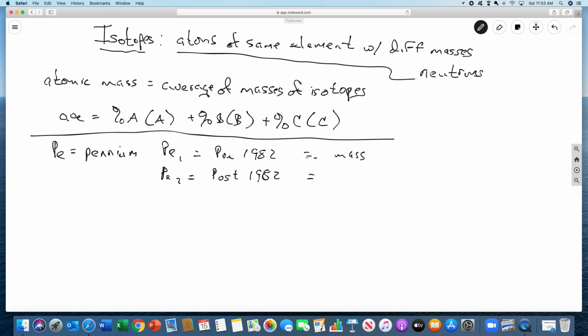And what you're going to do is you're going to take 10 of the pre's and get the mass and then divide by 10 to get the average, because each penny will be a little bit different, right? Then what you're going to do is you're going to take 3 of these and 7 of these, so that this total is 10. So that means this is 30% and this is 70%. And these will not affect your sig figs because you counted them, so these are pure numbers.